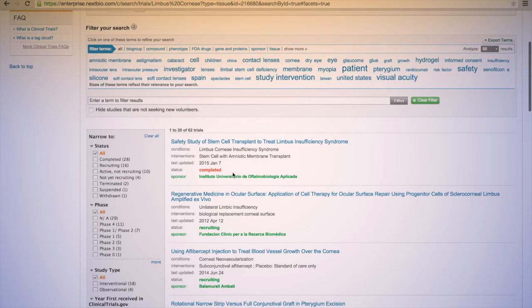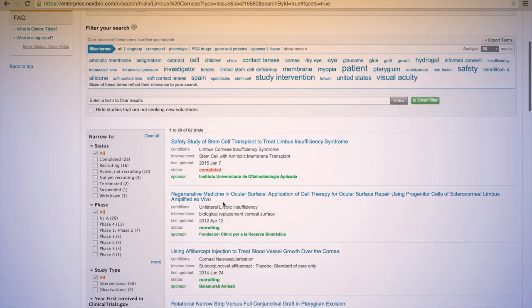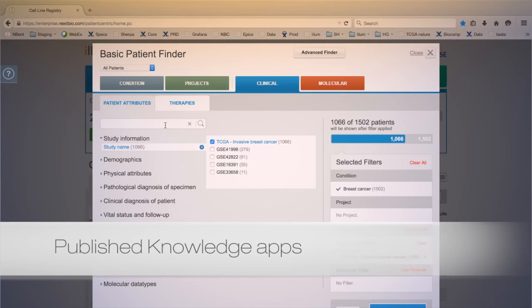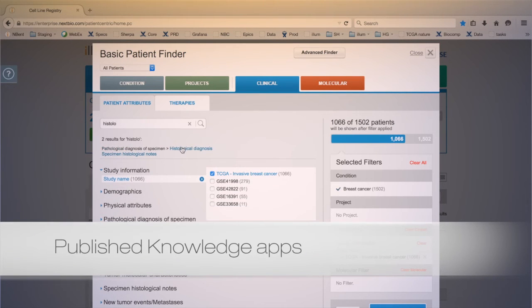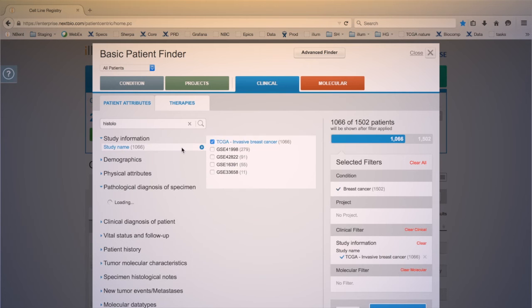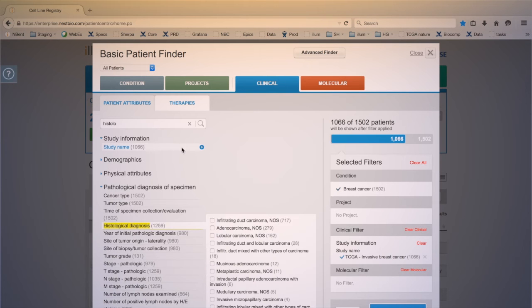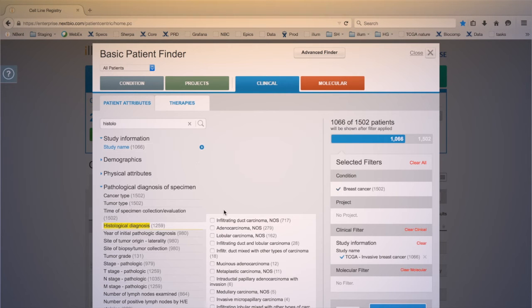Access relevant information with the Published Knowledge apps. Perform text-based searches of public databases and find answers in seconds.